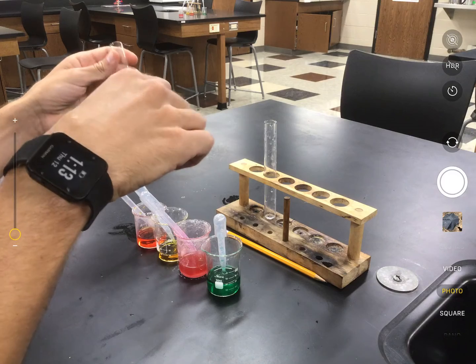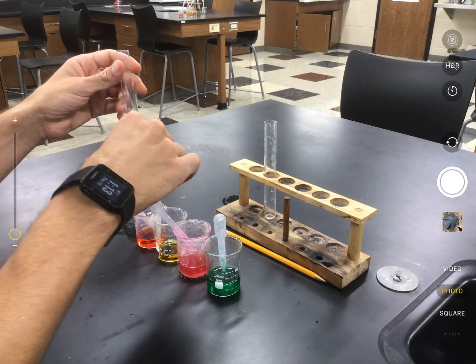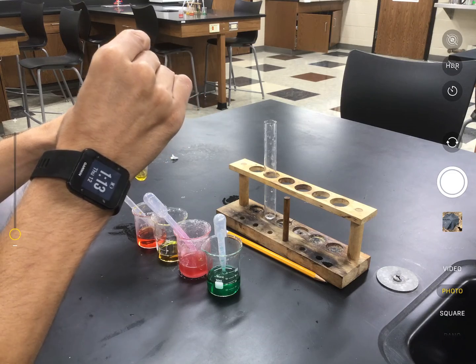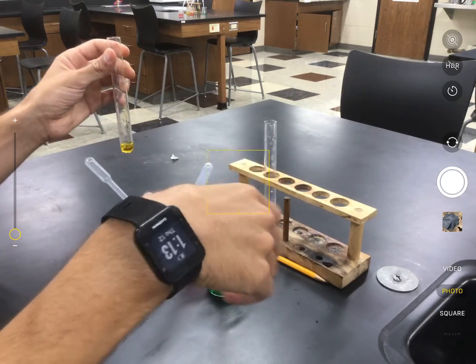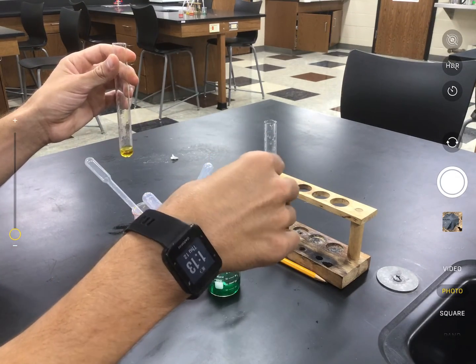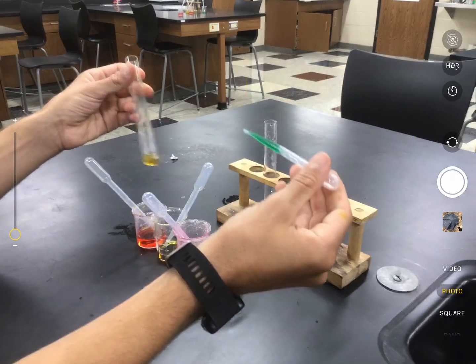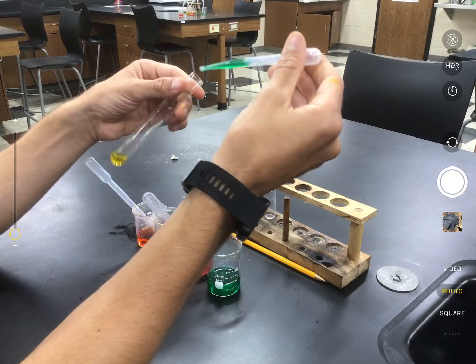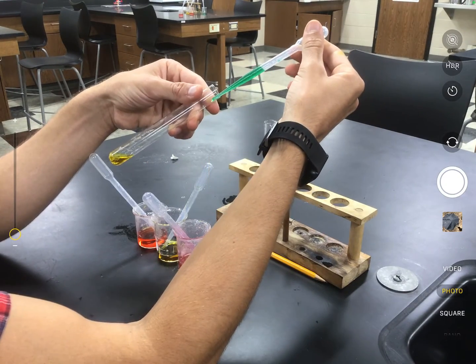So I'm going to start with yellow. So we have yellow, and then now we're going to do green. Now, since I've got the first color of liquid in there, I now have to put the green on very slowly and make sure the test tube is tilted.